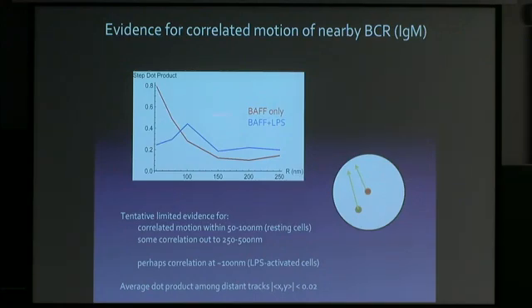And what we can see is that in the untreated cells, so the inactive cells, you actually have some correlated movement at the smaller distances, and this more or less goes away. I did check, by the way, that particles which are not close together, where I made the separation really big, actually have 0 here. I get a very tight value on 0 for particles which are far apart. With the activated cells, there's some correlation, but it seems to be less. This is something that we can investigate, for example, by treating the cells with other drugs or looking at different cell types.